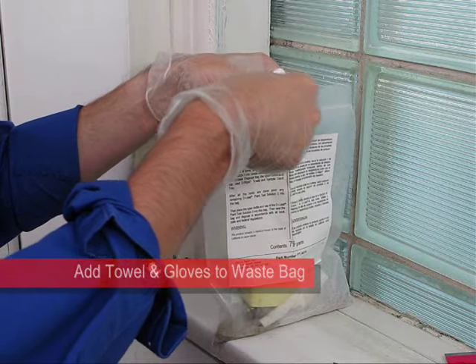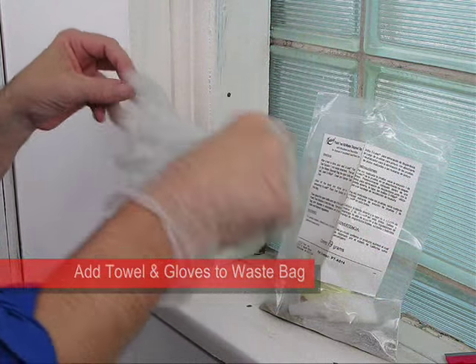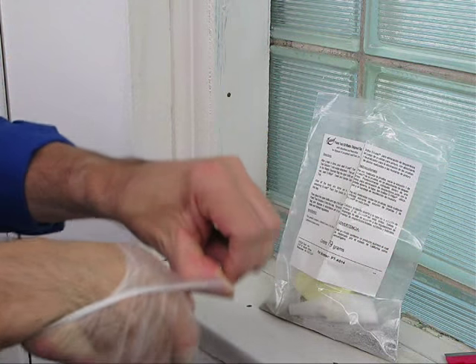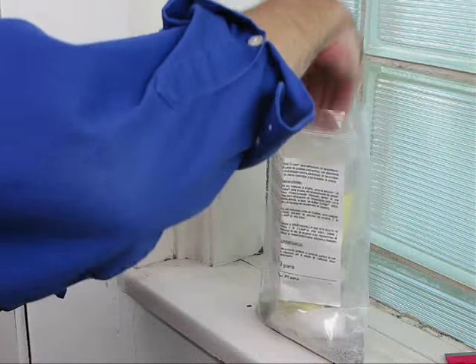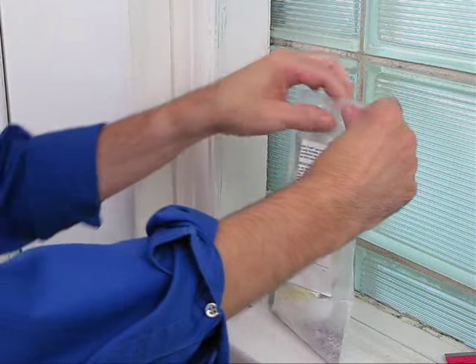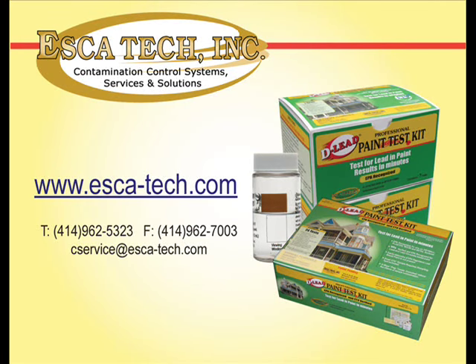Next, place the D-Wipe towel and your disposable gloves in the waste bag. After you've used all the tests in the kit, place the Solution 2 bottle into the waste disposal bag as well. A digital copy of an EPA-compliant record-keeping form is available at www.esca-tech.com. For more information, please contact Esca Tech or go to www.esca-tech.com.